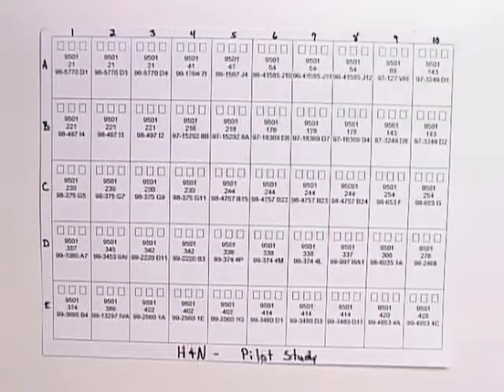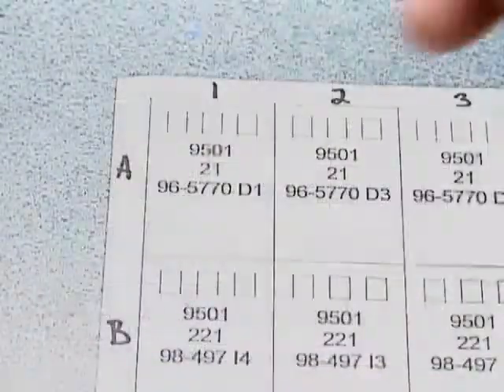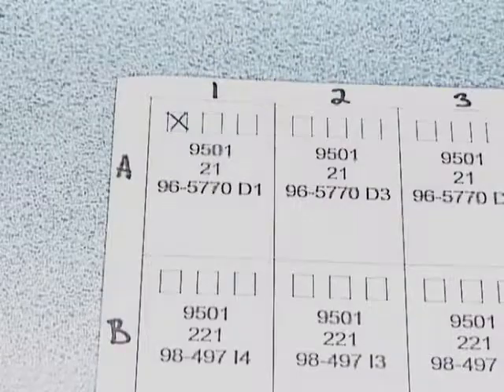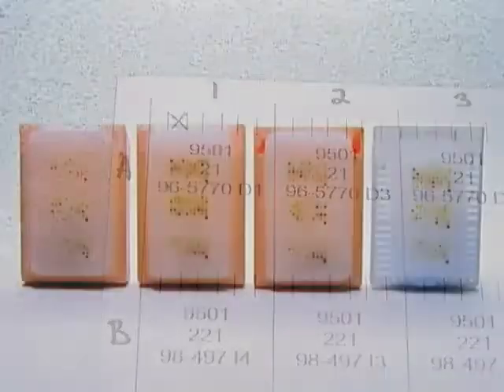The grid paper will be the array map. Mark the grid paper each time the slide and block is pulled and punched. This will minimize mistakes like double punching or skipping a specimen.